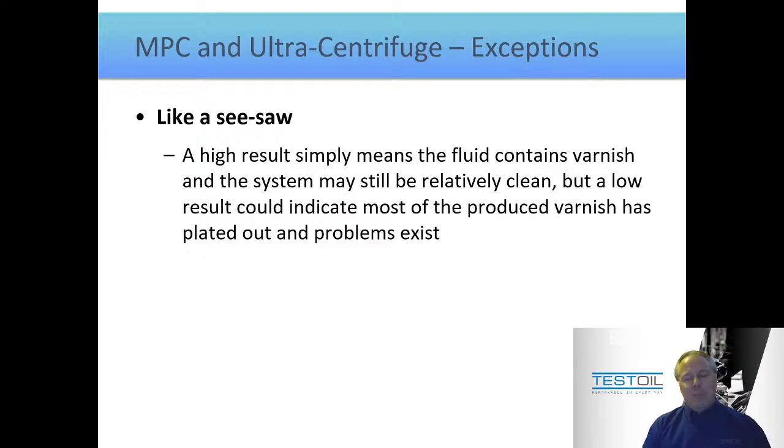So it's very important that you trend your results and look for changes in this trend, because if your results climb steadily, which is generally what's expected over the course of a few years, that would be expected. But if they suddenly leveled off, that would probably indicate to you that they're starting to plate out. If these values ever decreased on their own, that would definitely mean they're starting to plate out.